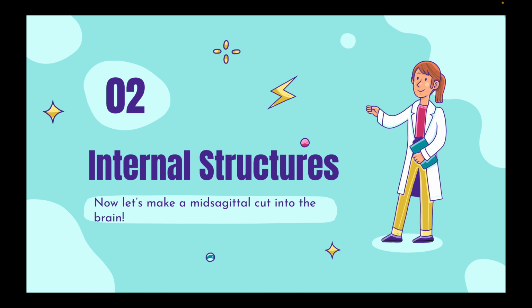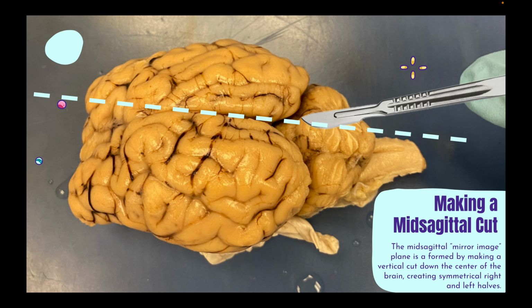But next we're going to look at the internal structures from a mid-sagittal cut into the brain. Making a mid-sagittal cut is like a mirror image plane. It is formed by making a vertical cut down the center of the brain, creating a symmetrical right and left halves.